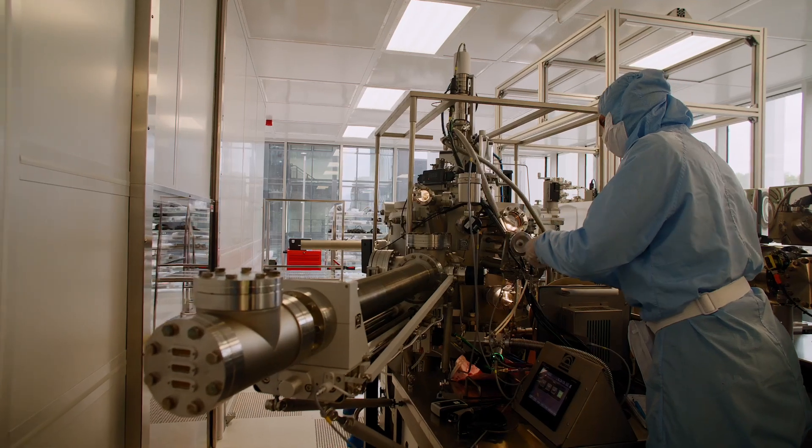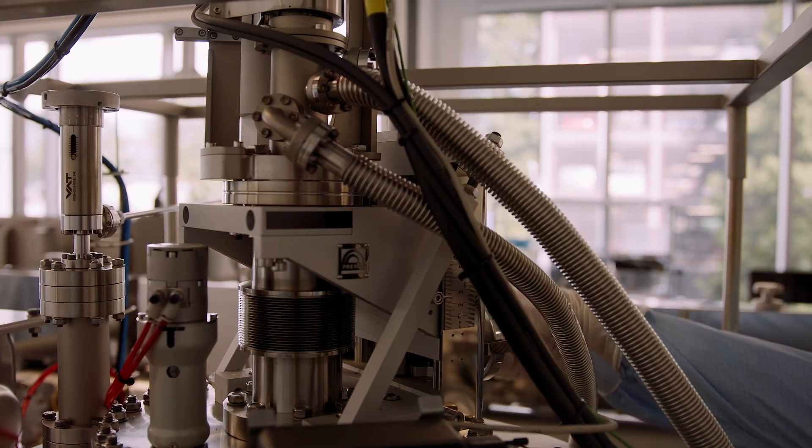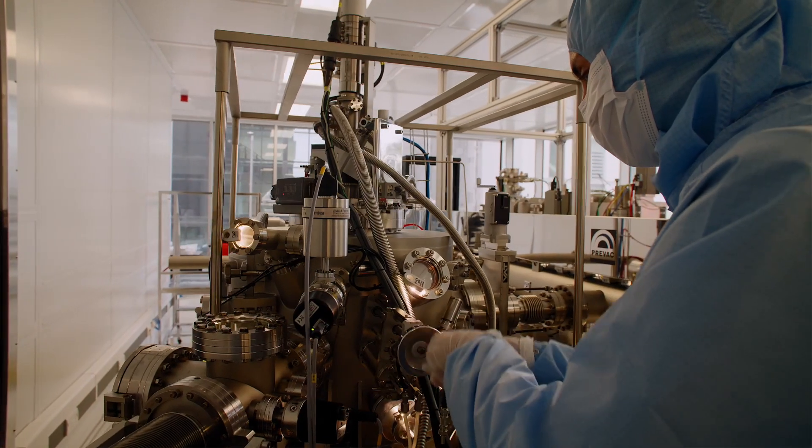The second system is the deposition chamber, a physical vapor deposition or PVD system that allows us to evaporate metals and produce either metallic contacts or coat surfaces with metals.